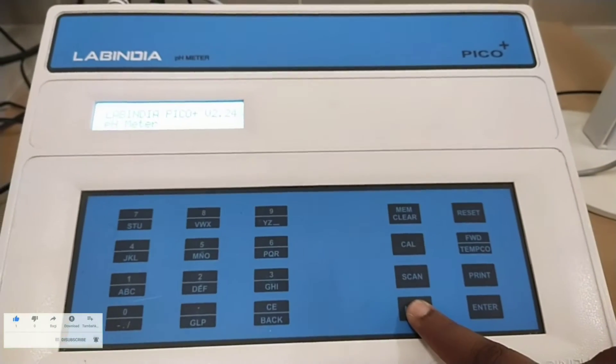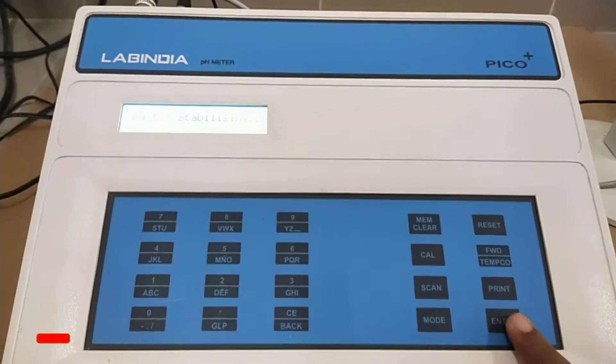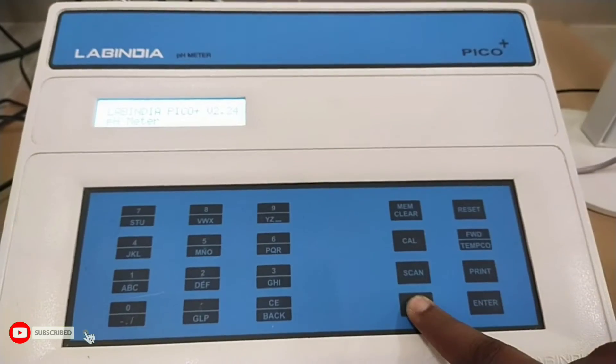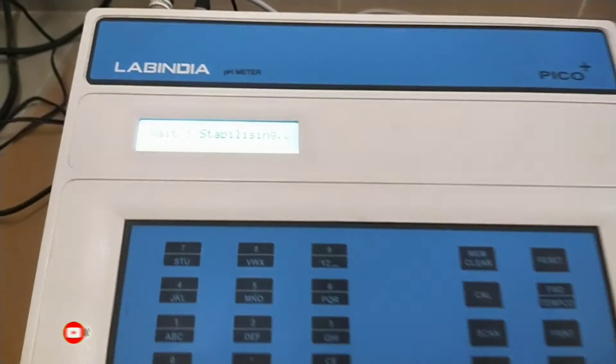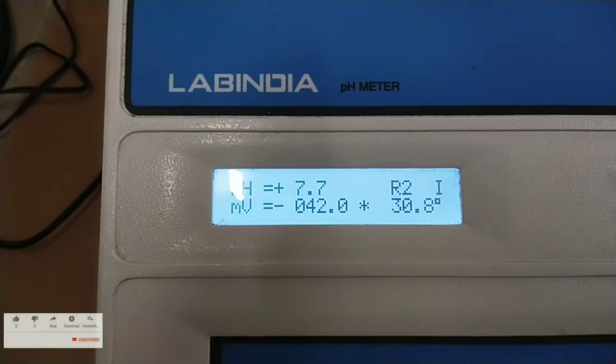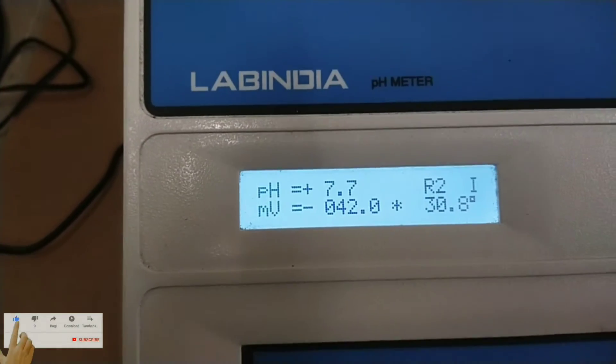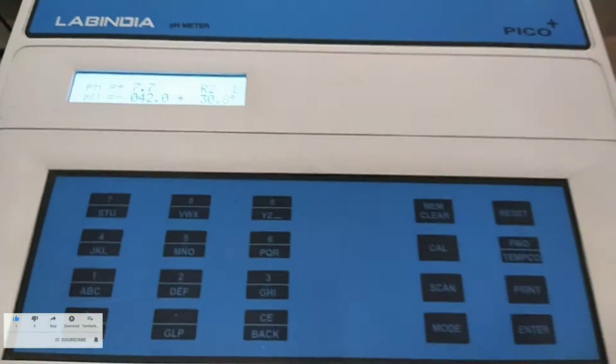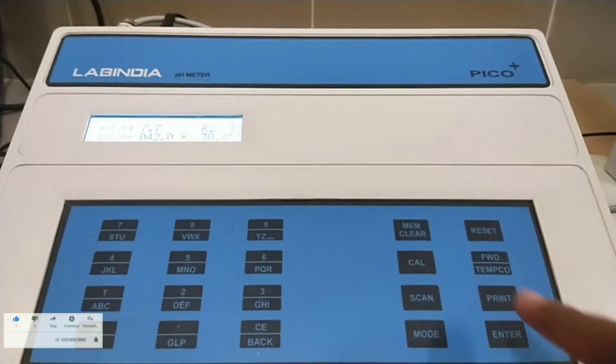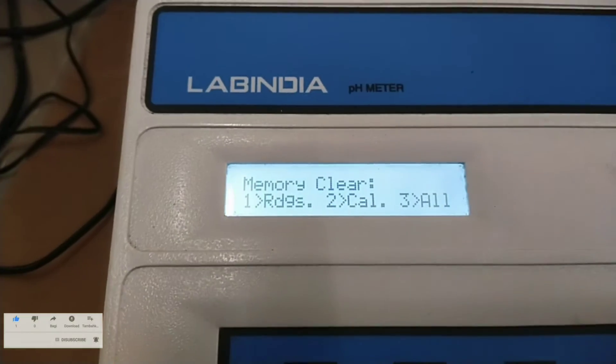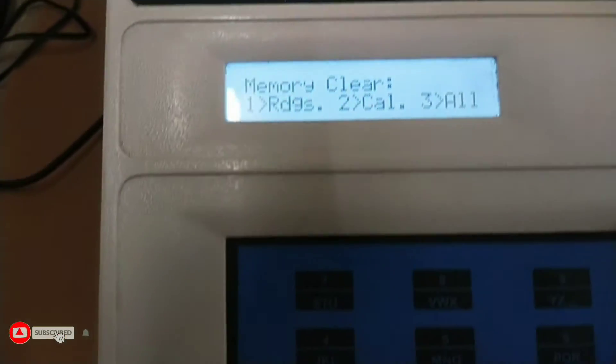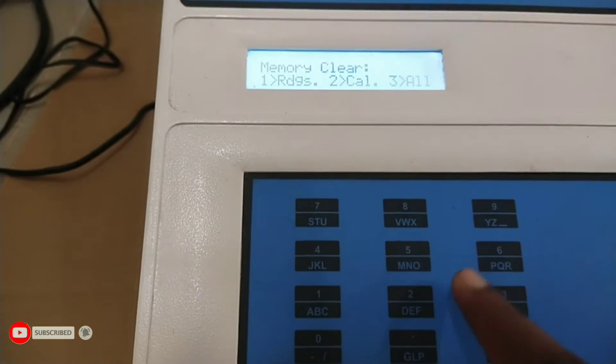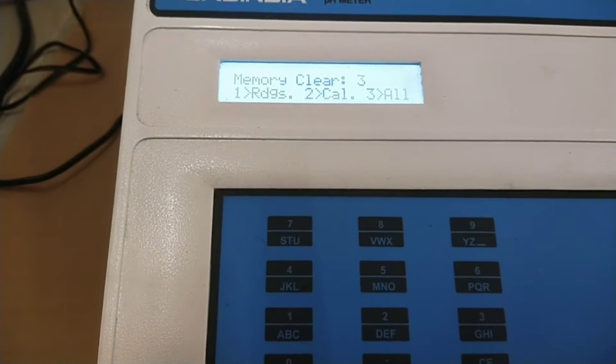The 20 character 2 line display will read as follows. Today we are going to calibrate the instrument through 3 point calibration. Now press mode and enter keys. The instrument reads wait stabilizing. It indicates the instrument is checking electrode signal stability and once the signal is steady it shows the measured pH, mV and temperature. Before calibration of the instrument or sample analysis you can clear data stored in the memory. Now press MEM clear key. Then press key 3. Then enter. Now the data is cleared.